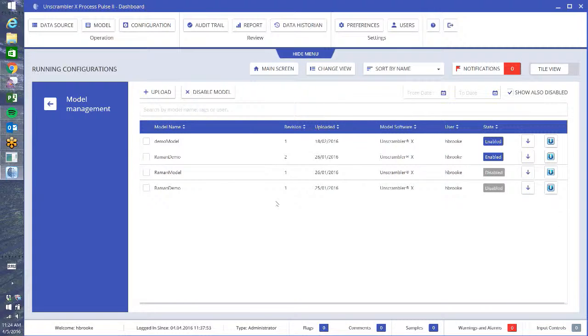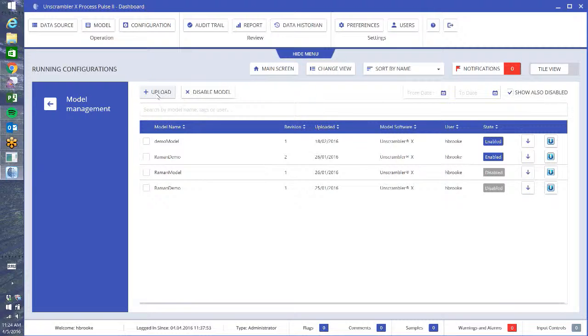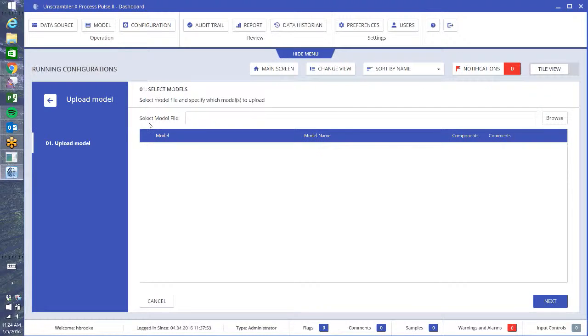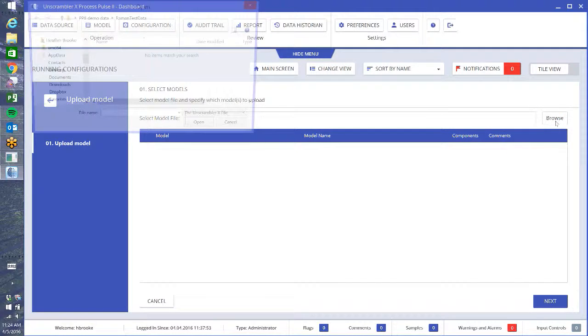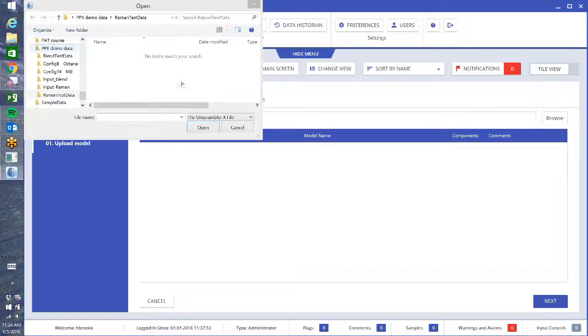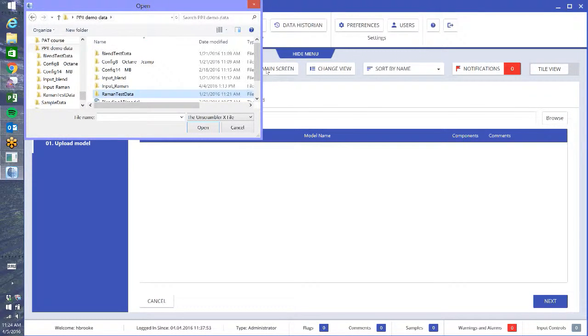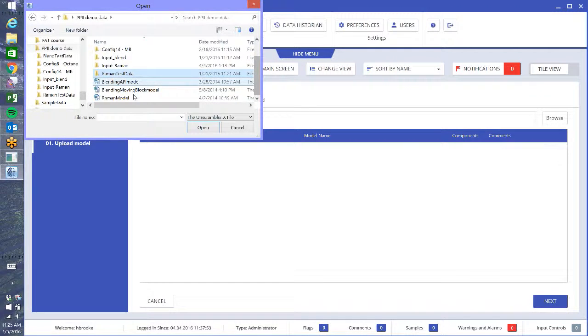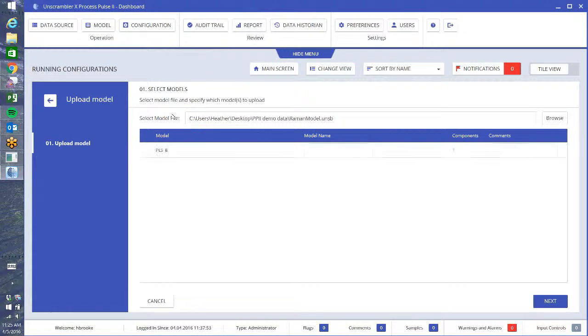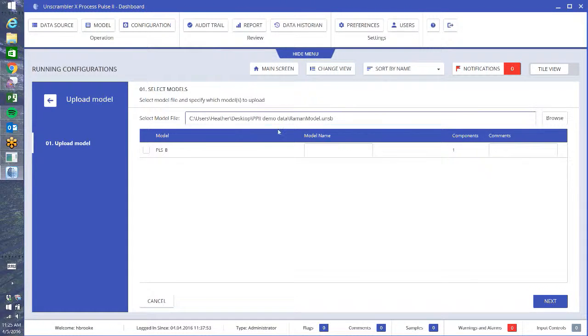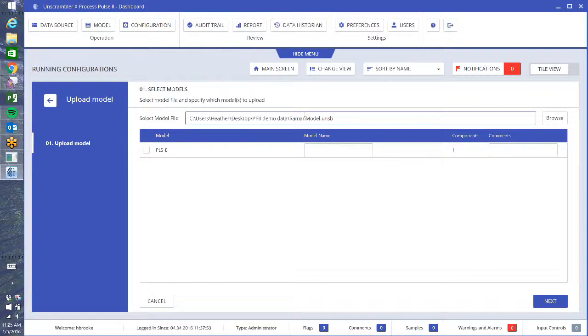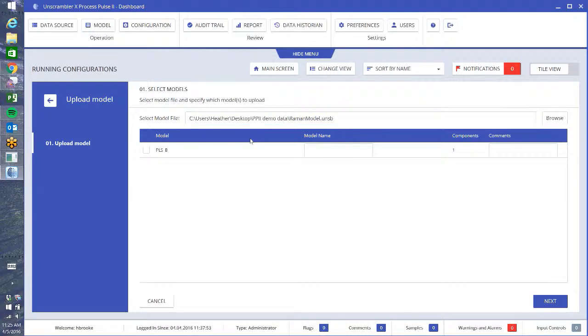So when we're in here, you can see I have a number of models in here. I have some that are enabled, some are disabled. So if something goes out of service but you want to keep it in the system, you can disable it rather than delete it, which is handy. So I'm going to press this button, upload, and I'm going to browse to where my model file is. I'm going to do this model, open. And I choose which model I want. In this case, I only have one model in this file. If you had more than one available model in that Unscrambler file, you would see multiple options.